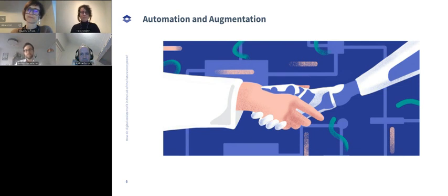It's taken about a decade, but we're seeing some of those concepts being put into practice. There's a company here in Boston called Cubotics that many of you might be aware of that's actually doing something along those lines. And so what we're seeing is the automation and AI parts are being used as tools to really augment the way human beings can actually innovate, and to outsource the repetitive nature, or maybe to train a system to innovate in a very defined space. But basically, I don't think it's really going to put scientists out of a job. In fact, it's going to be the other way around. It can make them increase their throughput. And I think that's what we're seeing now in the industry.